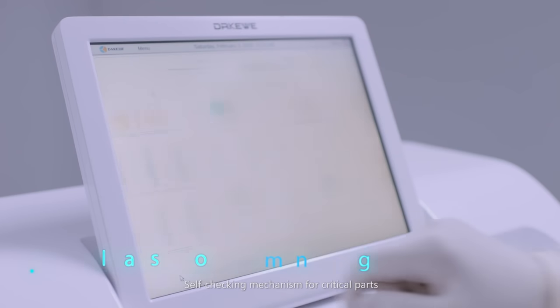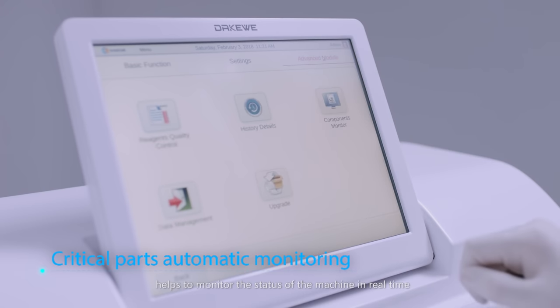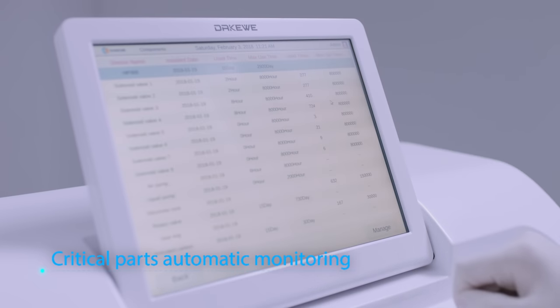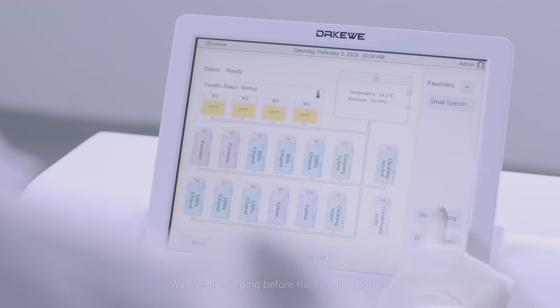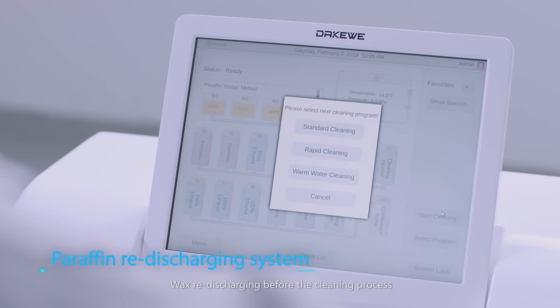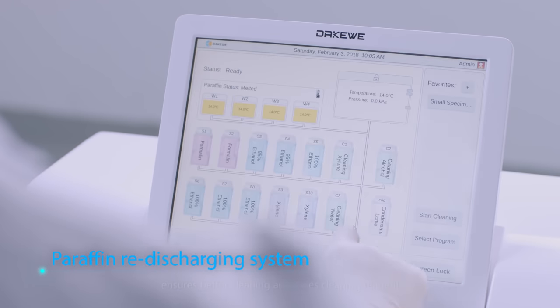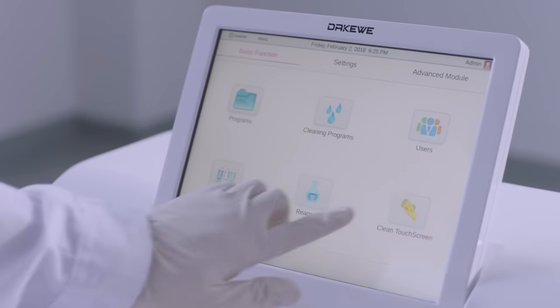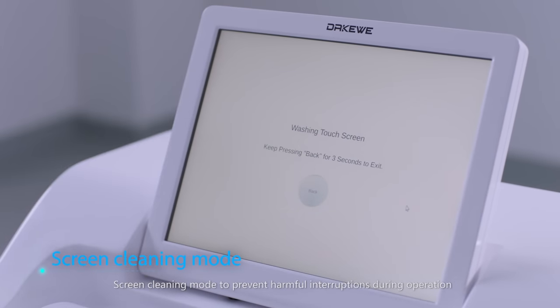Self-checking mechanism for critical parts helps to monitor the status of the machine in real time. Wax re-discharging before the cleaning process ensures better cleaning and saves cleaning reagents. Screen cleaning mode prevents harmful interruptions during operation.